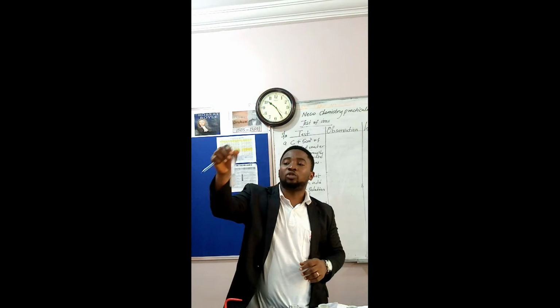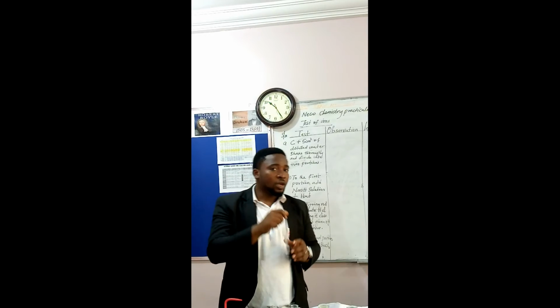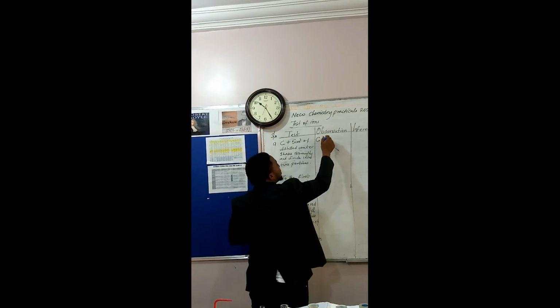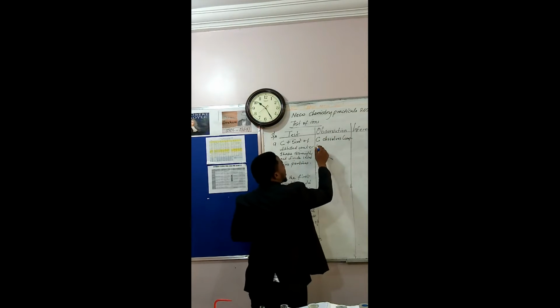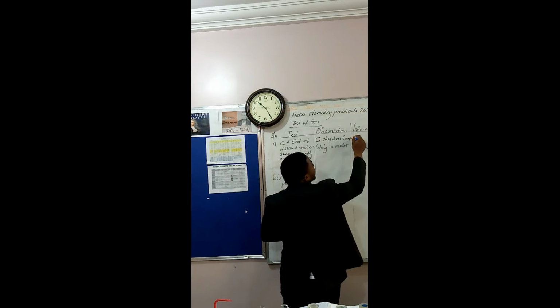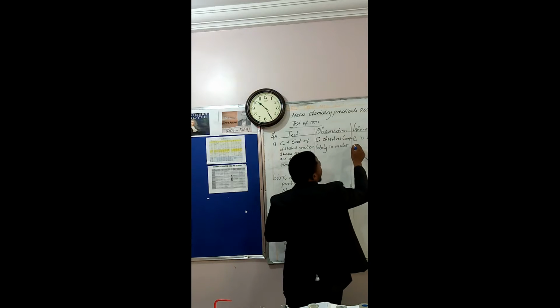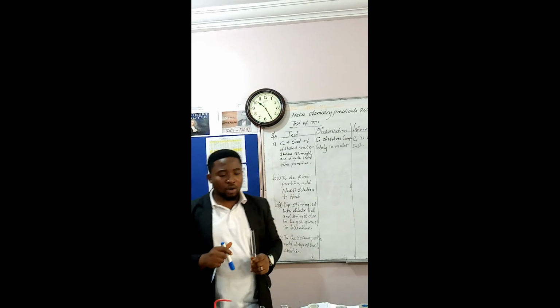So I've added 5 cm³ of distilled water to sample C and shaken thoroughly. Obviously, you can see that C is very soluble in water. So what will be my observation? Alright, C dissolves completely in water. And my conclusion will be that C is a soluble salt.